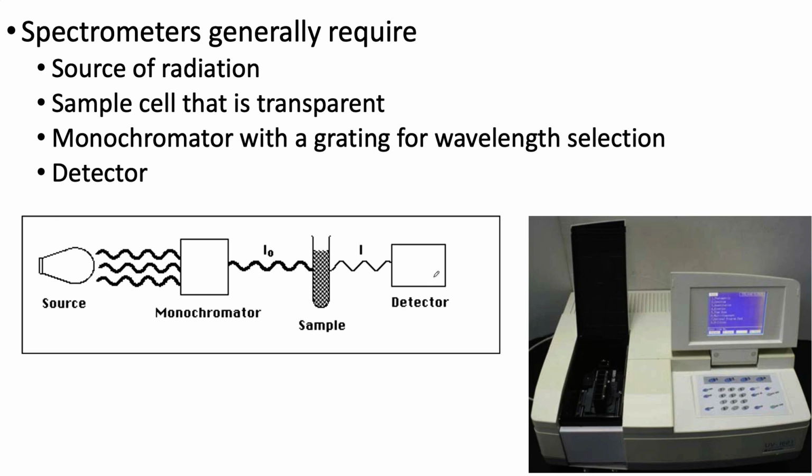Now, there are other kinds of spectroscopy. This is for absorption. There's also emission spectrometers, which is different, right? You're looking at the emission. And there's fluorescence spectroscopies, which we'll talk about. But this is just one type, right? And we'll broaden ourselves into the other types later. This is an absorption spectrum that you're measuring.